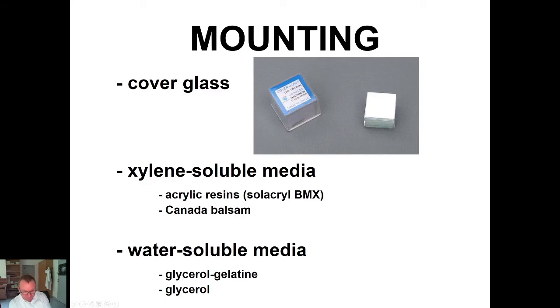After staining, there has to be mounting, which I already described as the covering of specimen by a very thin cover glass. Of course, this cover glass has to be stuck to the surface of the specimen by special mounting medium, which can be some resin or water-soluble medium, but the most frequently used is Solacryl.